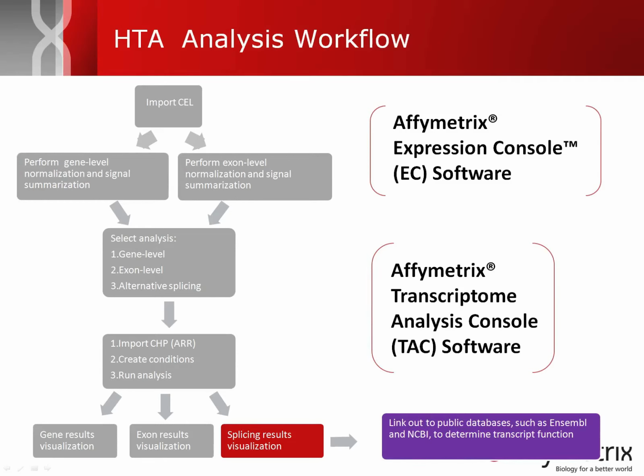There you can do either gene level analysis, exon level analysis, or alternative splicing analysis. Today we'll be concentrating on how to do the alternative splicing analysis and visualizing the splice analysis results in TAC.